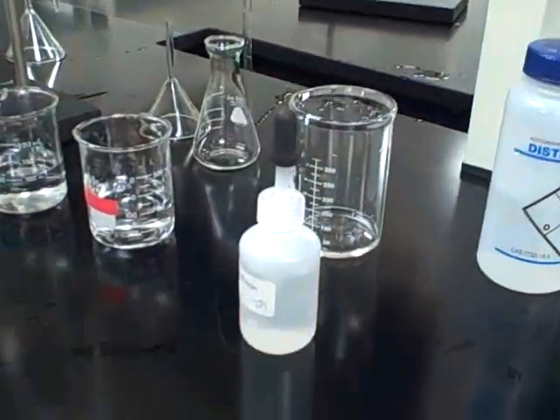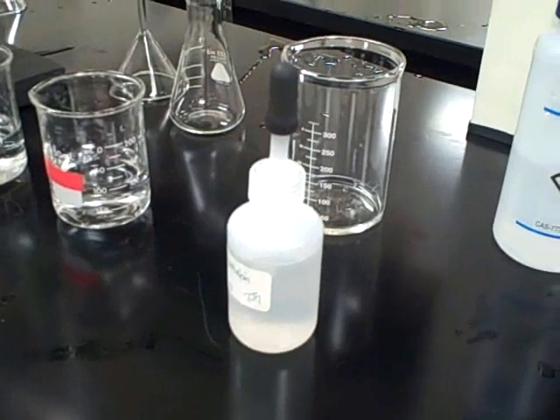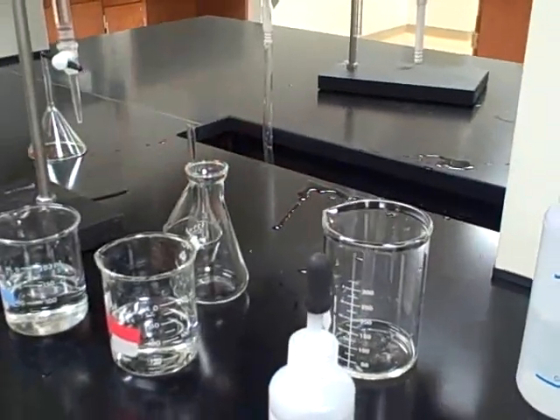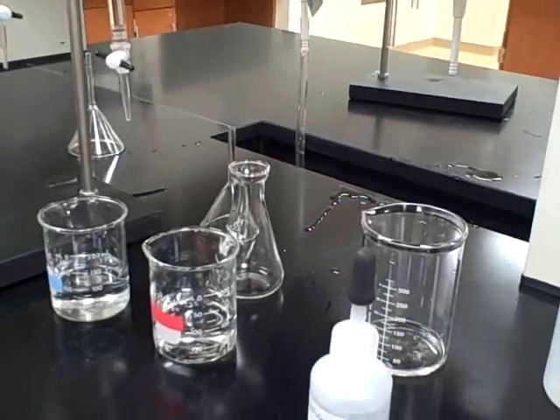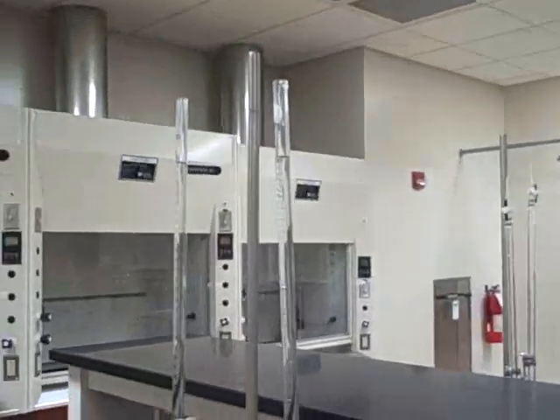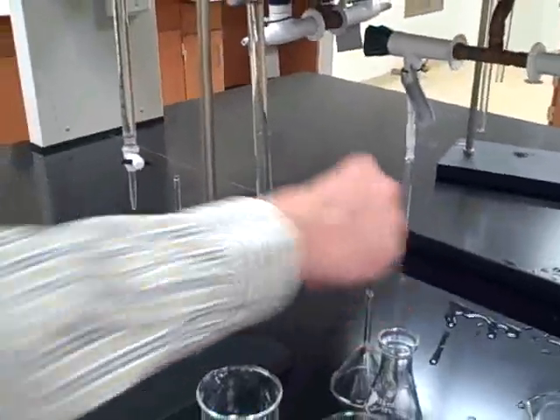The phenolphthalein indicator is in this dropper bottle. I gave them a waste beaker and a flask to do the titration in. The instructions say the burettes should come filled with water, so they're filled with water right here, and they get two funnels they're using to fill the burettes.